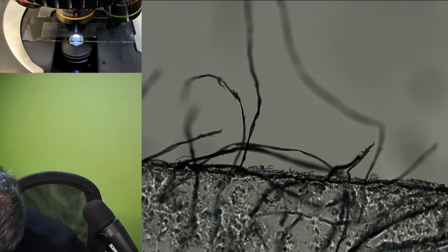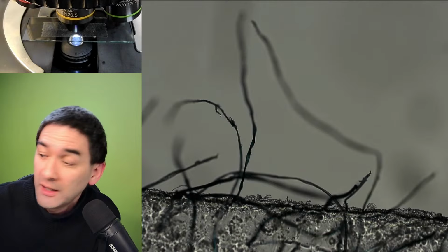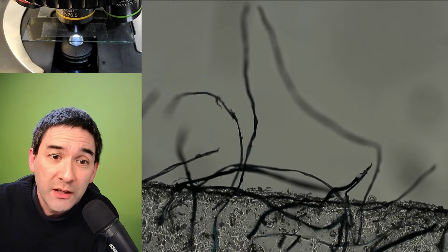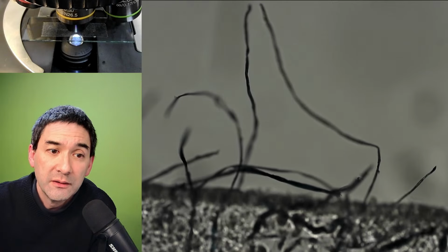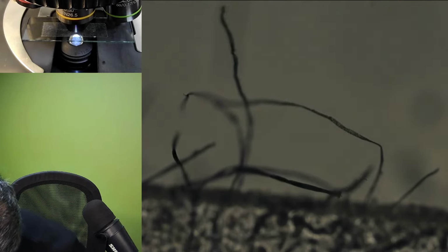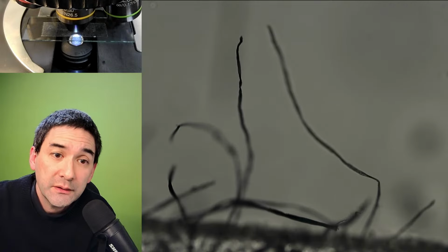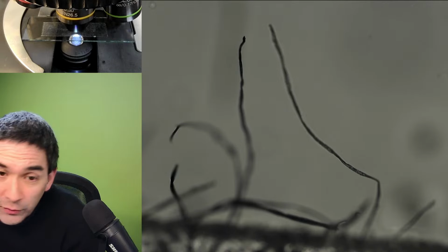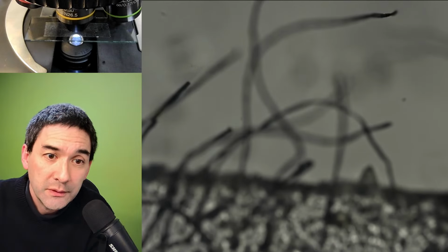Yeah, look at this. Did you just see that? Look how it's moving? I was just kind of breathing on it, and then as it dries, it starts to move again. You can make those fibers move, and this actually freaks out some people. And I'm saying, come on, man.